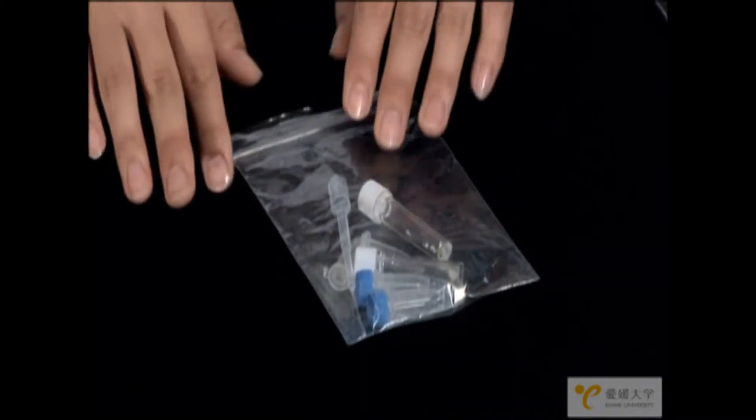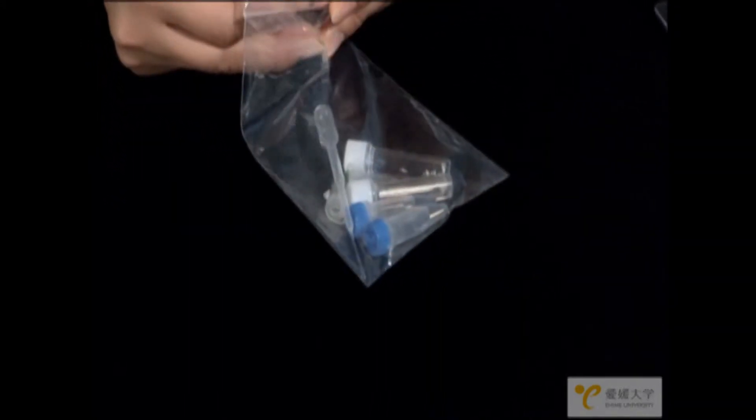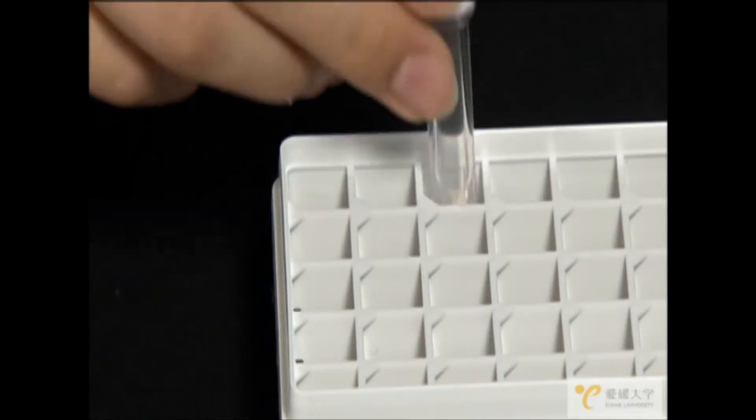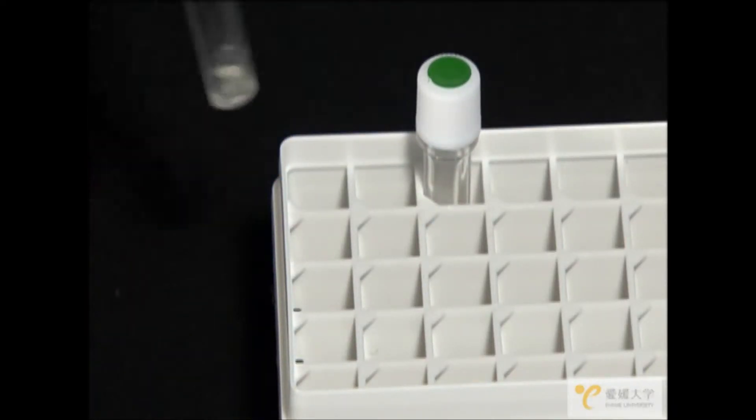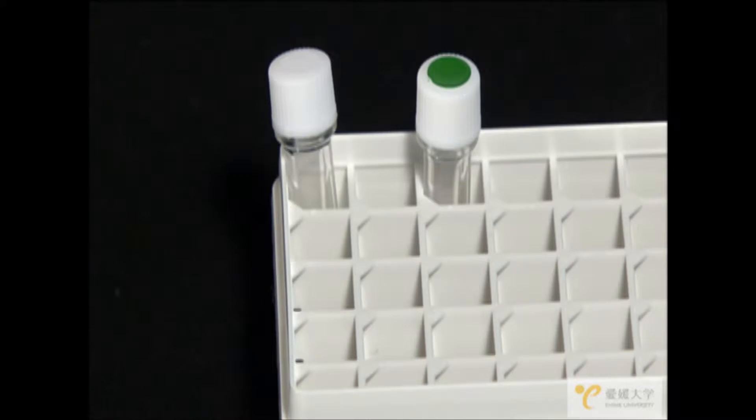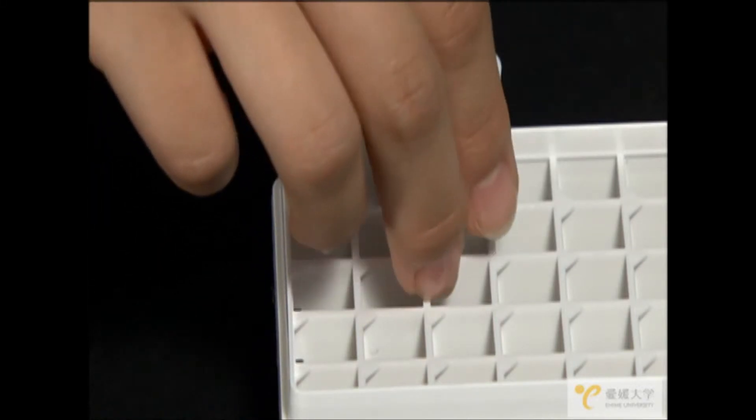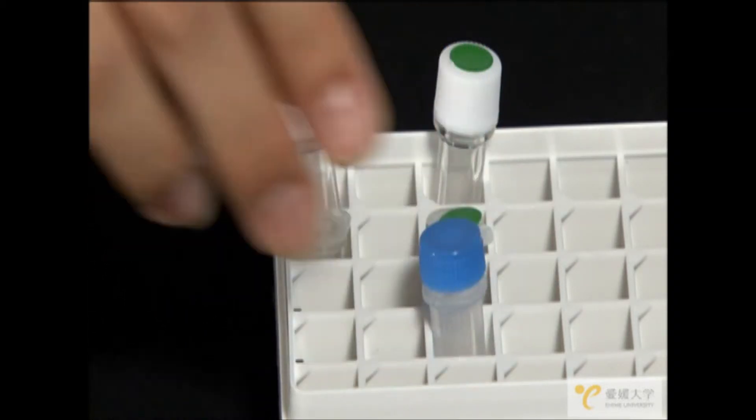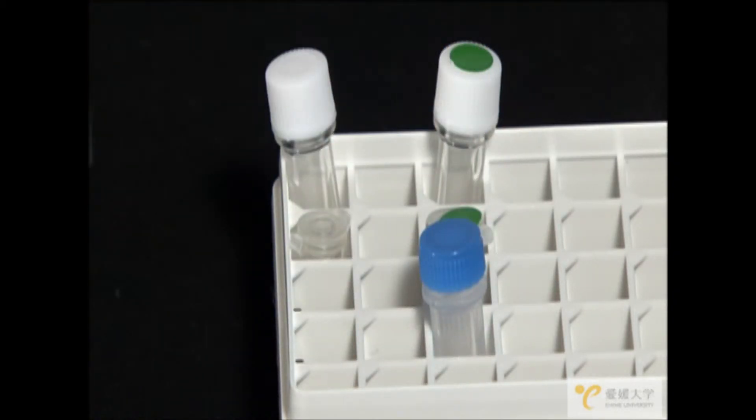Before beginning, let's make sure we have everything we need. Two tubes with white caps, one with a green dot on the cap, one with no dot. Two small tubes, one with a green dot on the cap and one without. Two tubes with blue caps. So all together there are six tubes and a dropper.